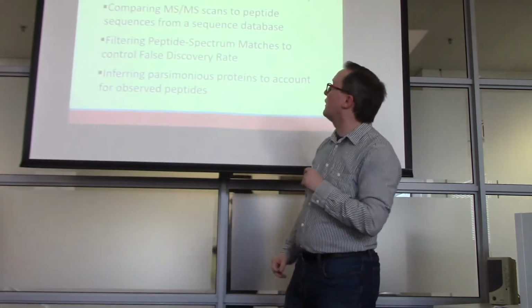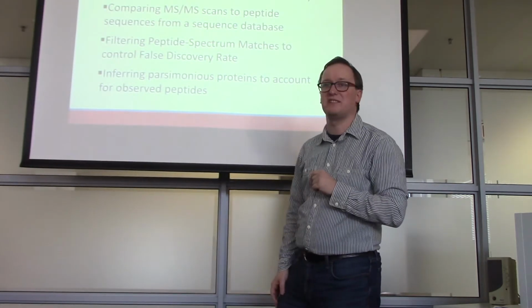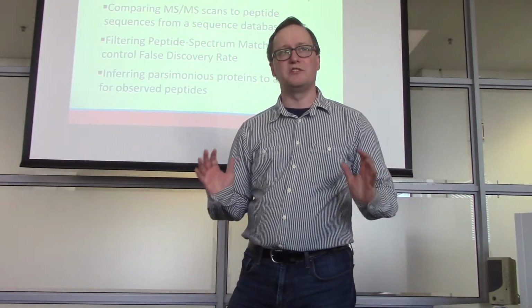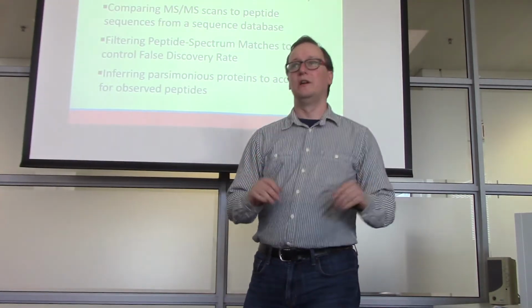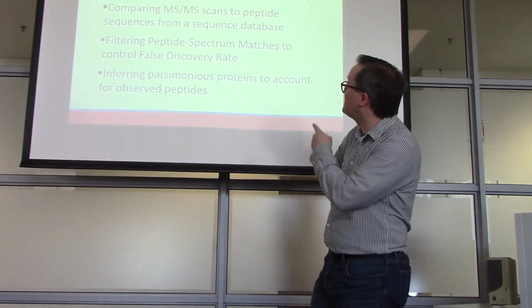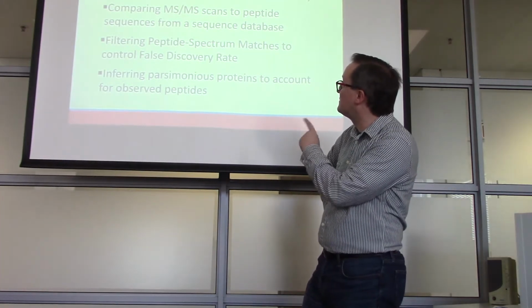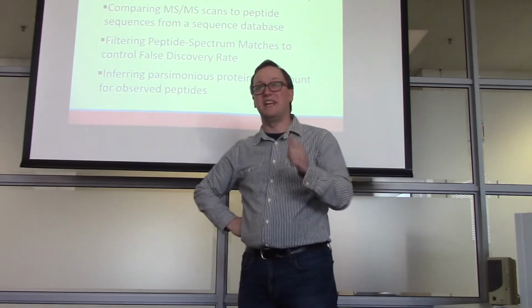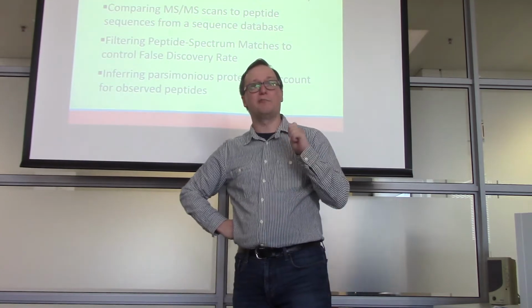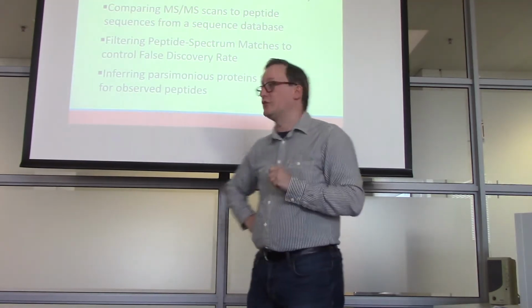Now, we're next going to talk about comparing MSMS scans. Every time I use MSMS, you might be confused by that, but I'm going to just note that's tandem mass spectrometry. How do we compare tandem mass spectrometry scans to peptide sequences that have been drawn from a sequence database? This is, at its nub, the killer application of proteome informatics, the database search engine.